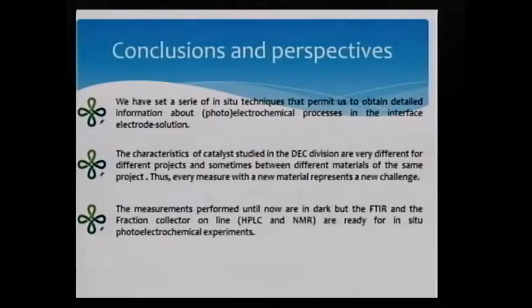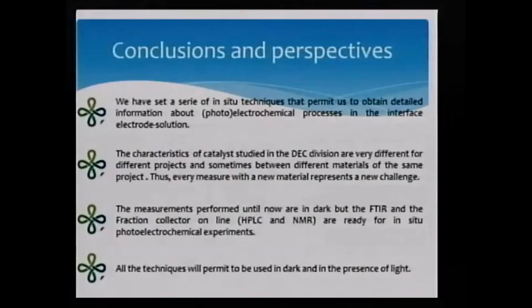We have performed several measurements, all in dark, except for the FTIR, the HPLC and NMR, that is to say the fraction collector. We can do that in dark and in light, but in several months, all the techniques will be able to be performed in dark and in light. And I think that next year we will publish several results in the frame of the CINE project.